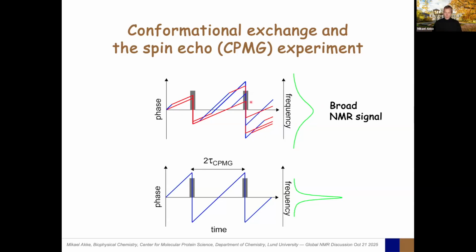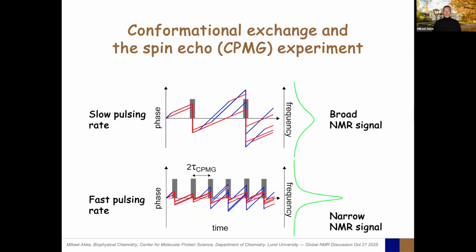And we can measure that for a fixed time, but instead vary the number of 180-degree pulses. So here we have 3 times as many. The evolution of the magnetization depicted here is exactly the same as up here. The jumps occur at the same positions in all cases, but we have more refocusing events, 3 times as many.